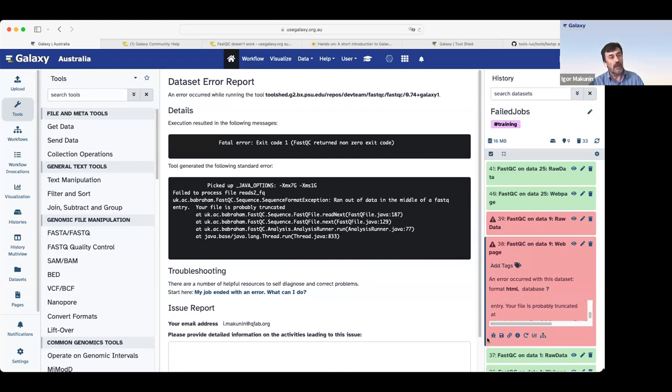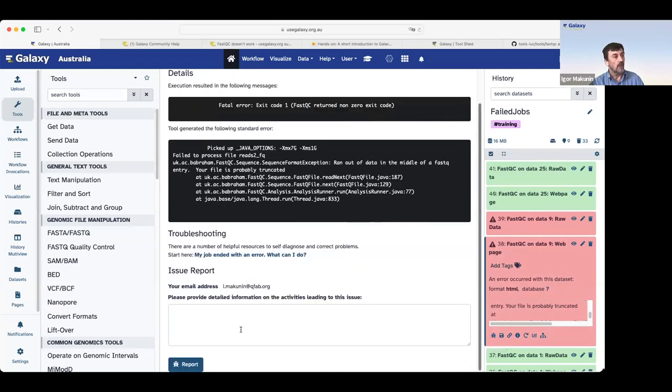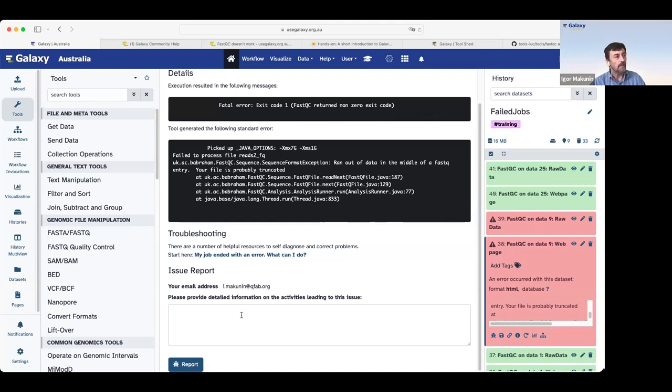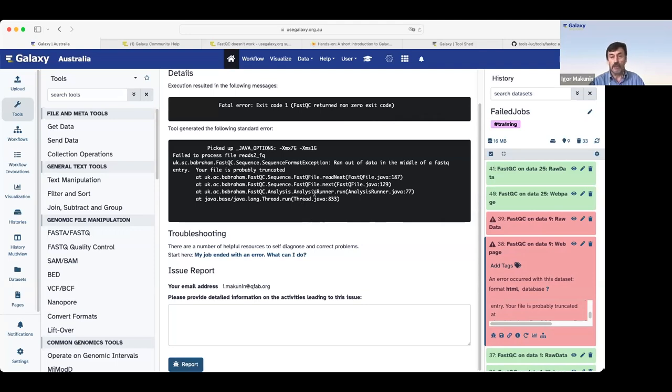If we click on the Galaxy error icon and scroll down, we see a tiny window where the user can write a description of a failed job. For example, I'm doing a training and my job failed here or I do something and hit report. Once I hit report, Galaxy will send a message to a support team. Keep in mind that this message will go to the support team of Galaxy server or Galaxy server you work on.